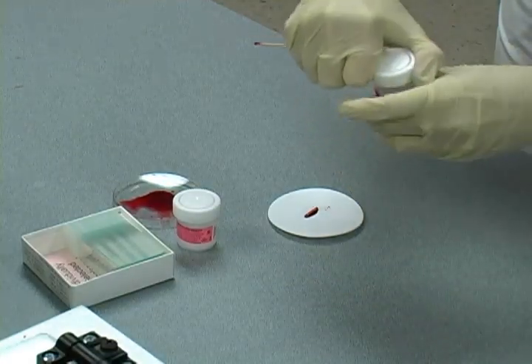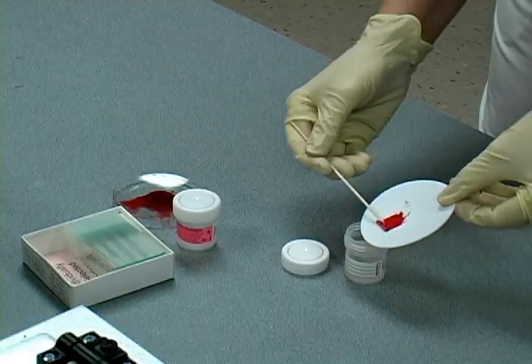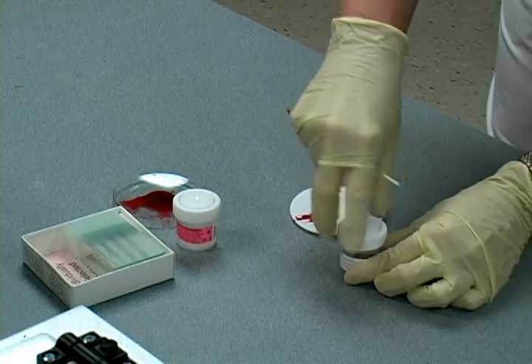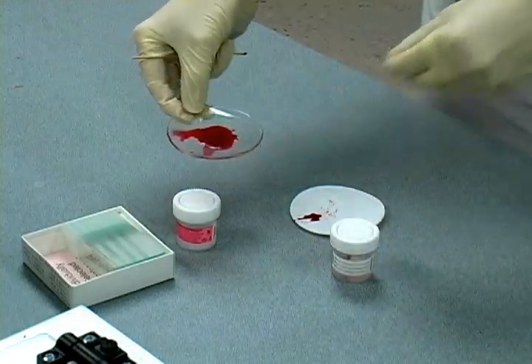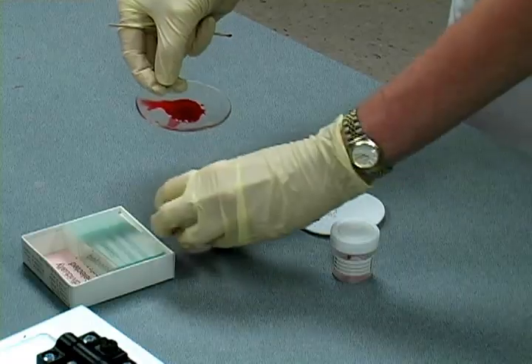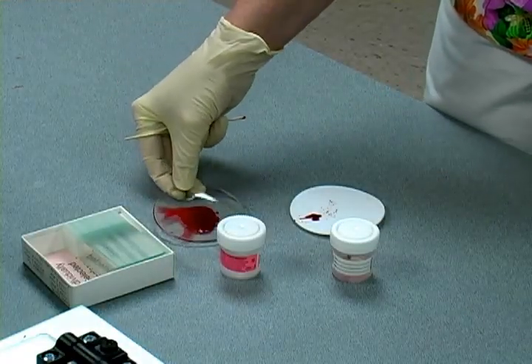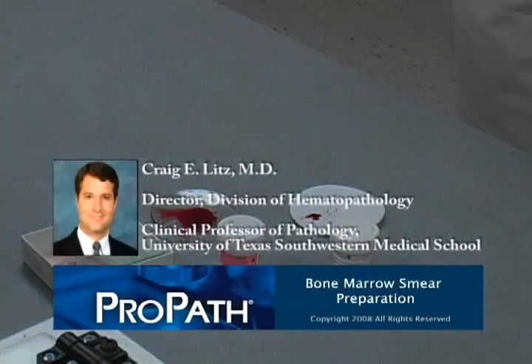Once all smear preparations are complete, the marrow core biopsy is placed into one of two formalin-filled plastic bottles and the leftover clotted aspirate is placed into the other. These plastic bottles are sealed into a small plastic baggie. This prevents formalin fumes from destroying the marrow and blood smear preparations during transport. The specimens are then sent to ProPath for processing.